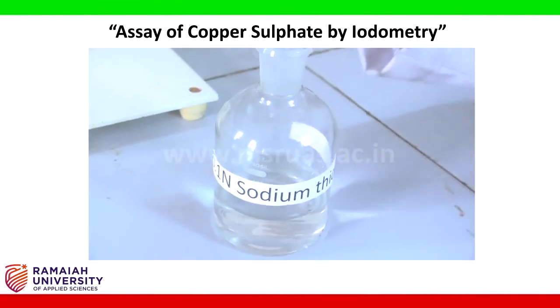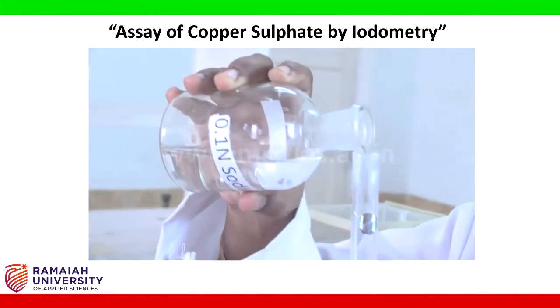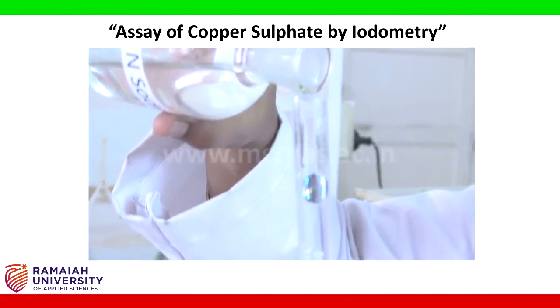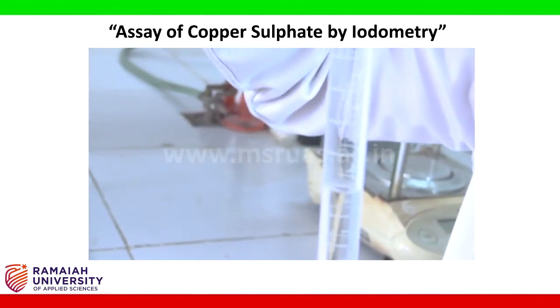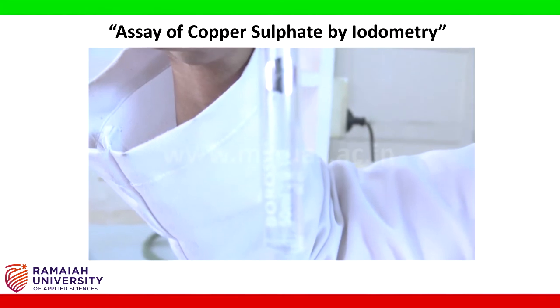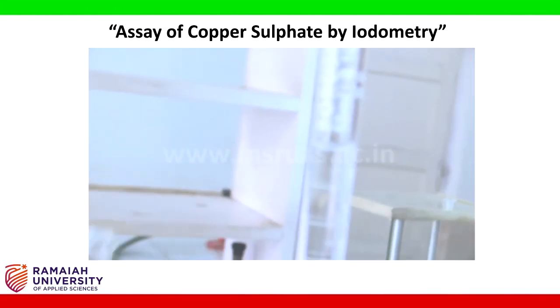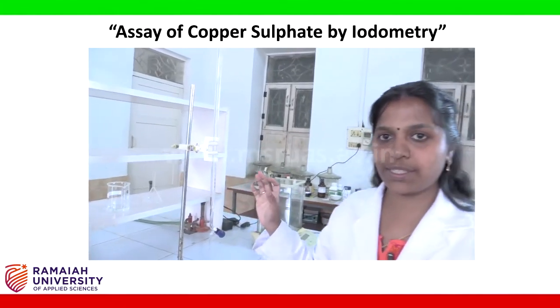Fill the burette with 0.1 normal sodium thiosulphate solution up to the mark and fix the burette in the burette stand.